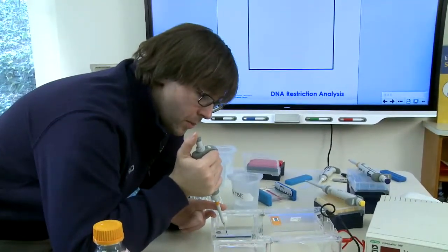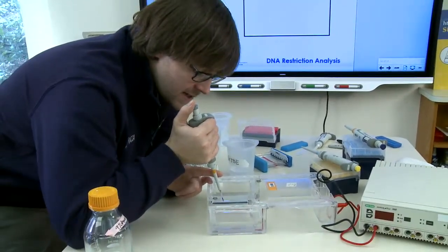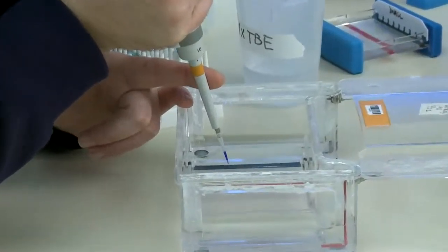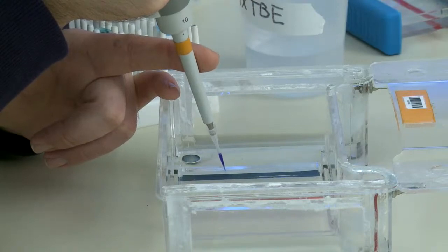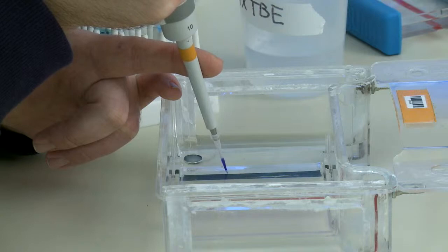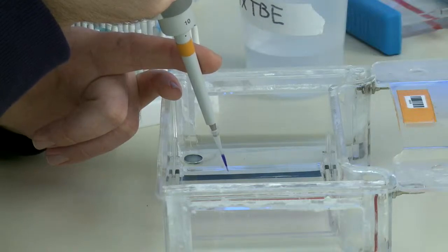So if you take the tip of the pipette and just go right beneath the surface of the liquid into the well, remember you're aiming for the well, you should already be in the well if you've added enough buffer just to cover the surface of the gel. So I'm going to go in just a little bit, and now I move the tip of the pipette up and down a little bit, and I can basically verify that I'm actually in the gel.